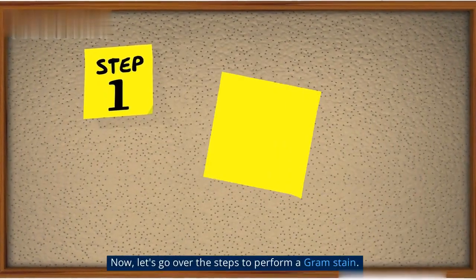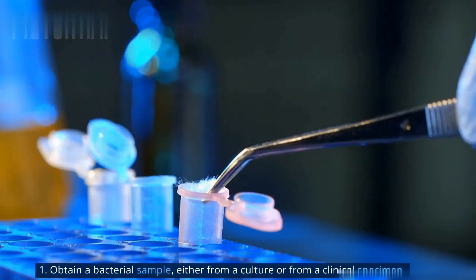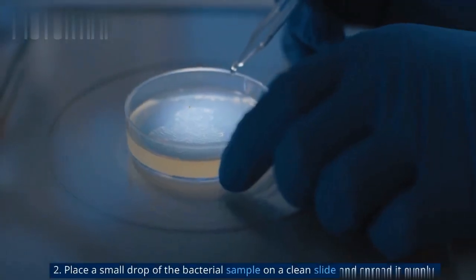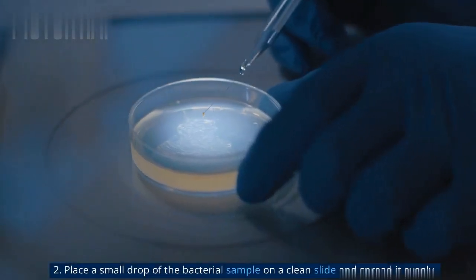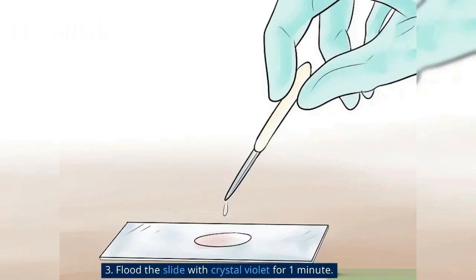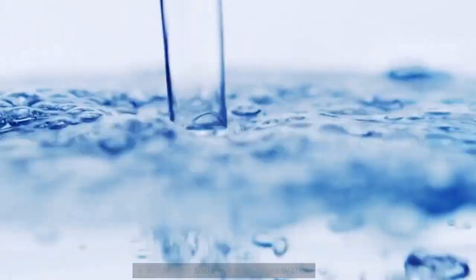Now, let's go over the steps to perform a gram stain. 1. Obtain a bacterial sample, either from a culture or from a clinical specimen. 2. Place a small drop of the bacterial sample on a clean slide and spread it evenly. 3. Flood the slide with crystal violet for 1 minute. 4. Rinse the slide with distilled water.